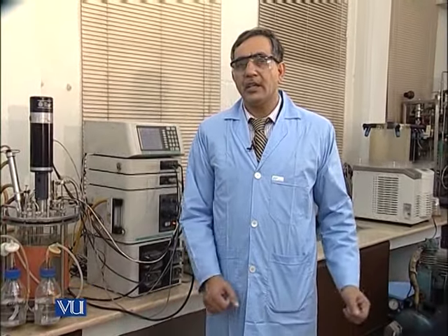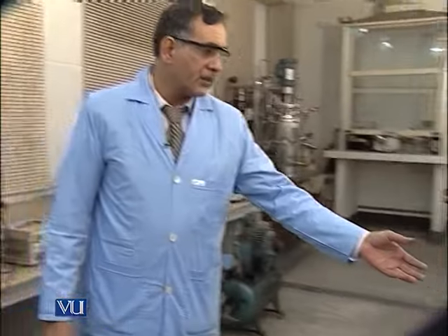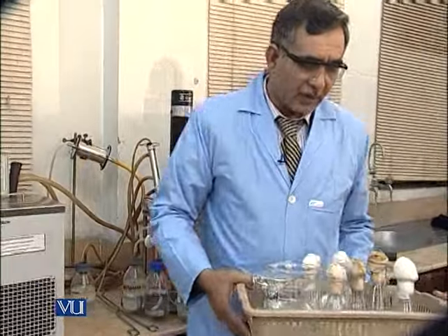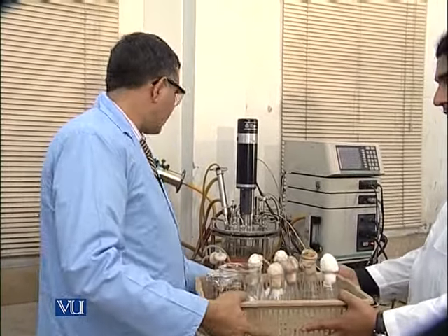Let's start inoculation. As you know, in our previous step, before making the fermenter, we inoculated 6 different flasks with the conidial inoculum, and we put them into the shaking incubator. Ramesh is already having those 6 flasks. So we have these 6 different flasks of the inoculum. You can see here the inoculum, which you have already seen.